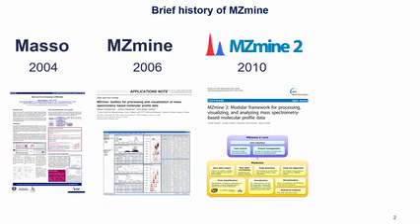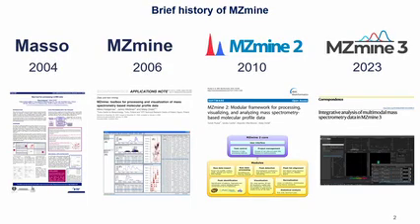And we published the result of this effort in 2010, at which point the software became modular and more suitable for high-resolution mass spectrometry analysis. And then there was a lot of development, many versions followed, up until we decided to introduce the next generation, which was last year, and then the paper about the third generation was published quite recently, a few months ago. And this included a lot of new improvements and new ways to process data and many different modalities of mass spec data, which I will talk about today.